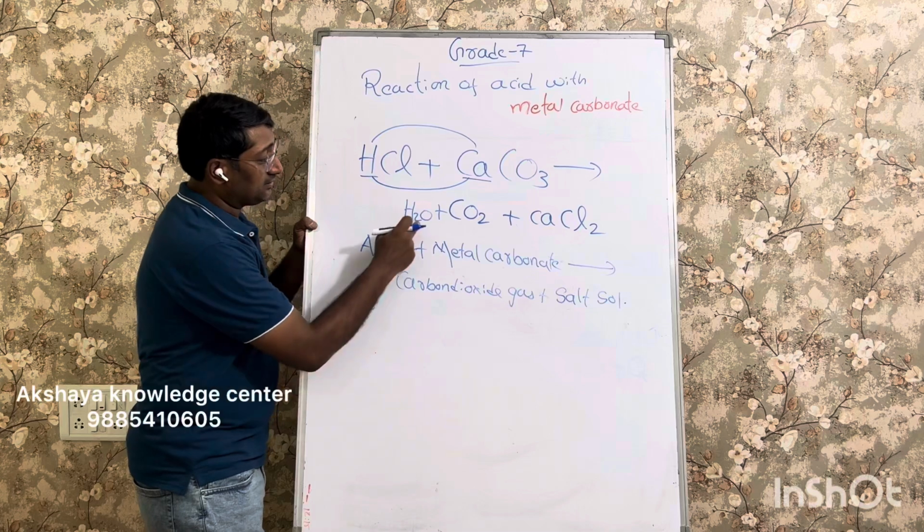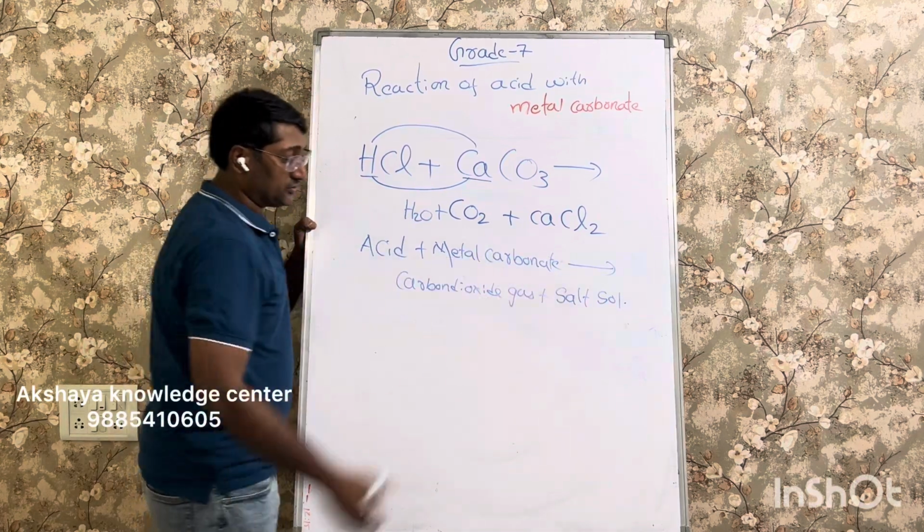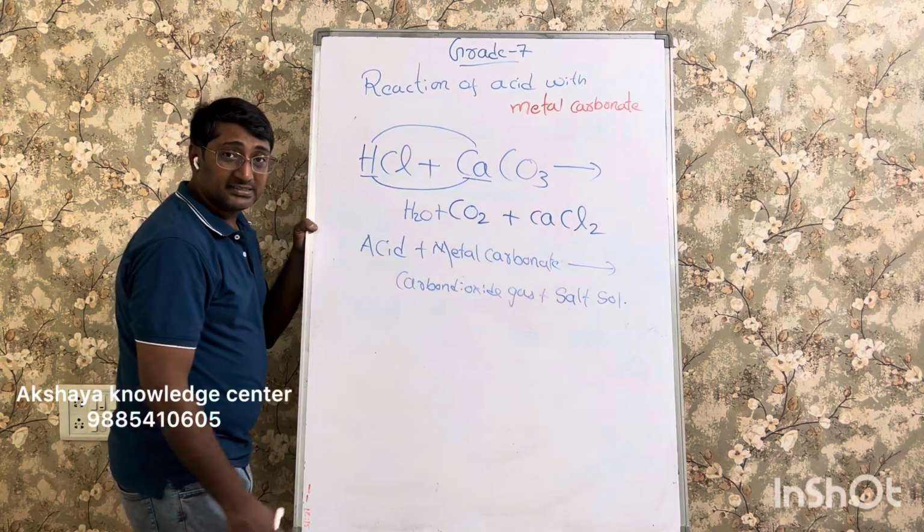Calcium chloride is a salt. This is water. Together we call it salt solution. So that is the entire experiment.